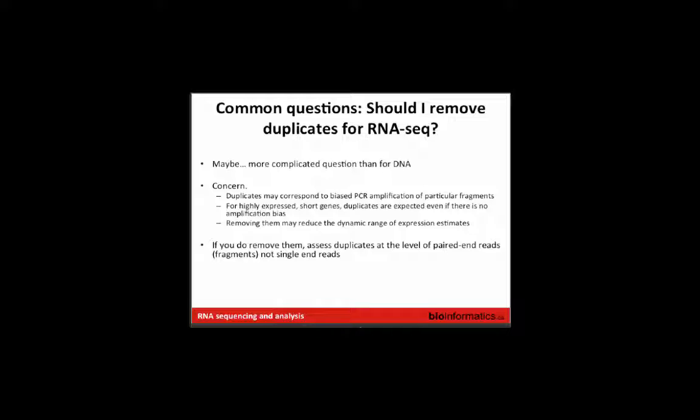Assess duplicates. Well, this is just a point to say that if you are going to remove or mark duplicates, then make sure you do it on the pairs, not on individual reads. Okay, so I think I was trying to shorten this, which obviously didn't work. So the comment is, how do you assess duplicates?